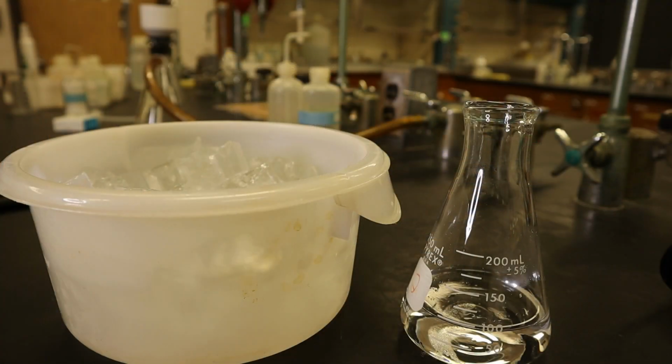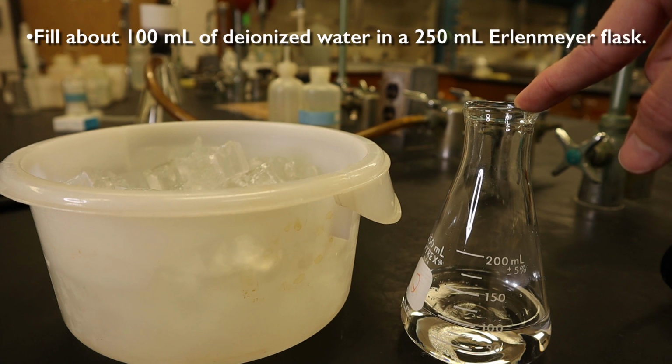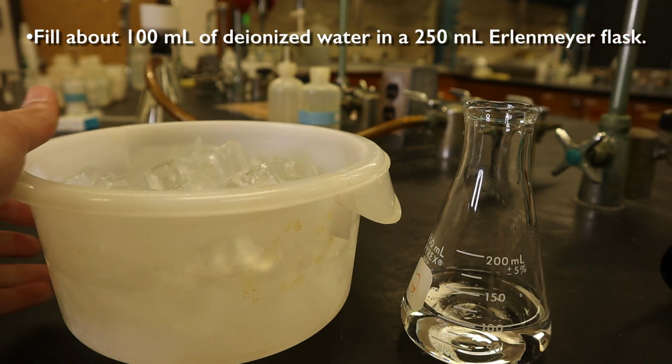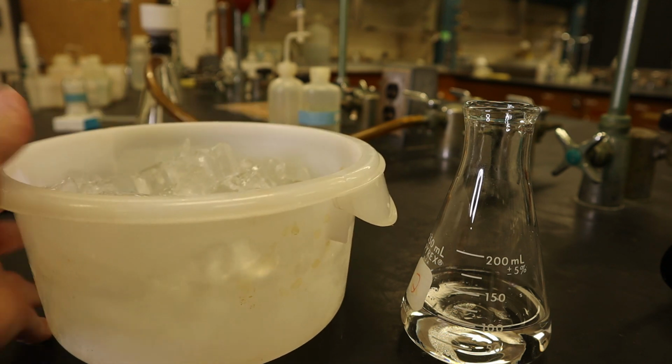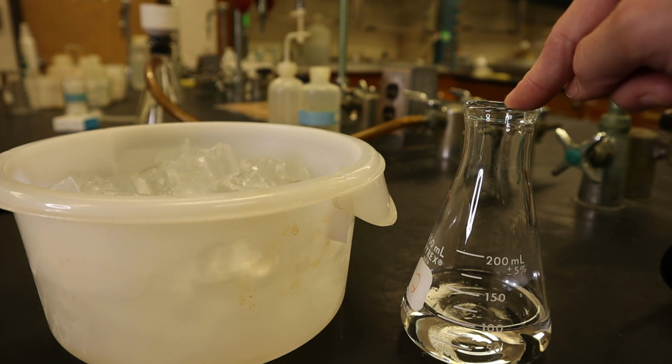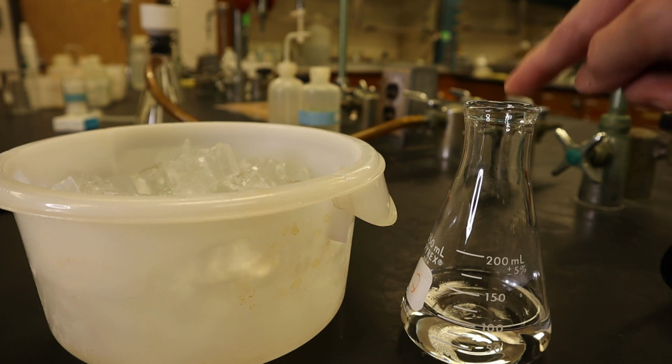In the meantime, I got a 250 milliliter Erlenmeyer flask to which I've added about 100 milliliters of deionized water. I also prepared an ice water bath that I'm going to be using to cool this water down. This water is going to be important later on when it comes to washing.